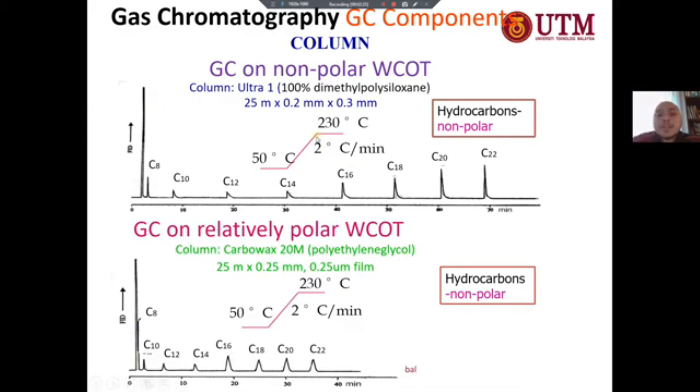If we look over here, the peak is tailing. Tailing is like this. It means that it's not really suitable to be used, because it reacts a lot with the column. So what can we do? There are several solutions. First, peak tailing usually appears because we inject too much sample volume, so we can reduce the volume of the sample.